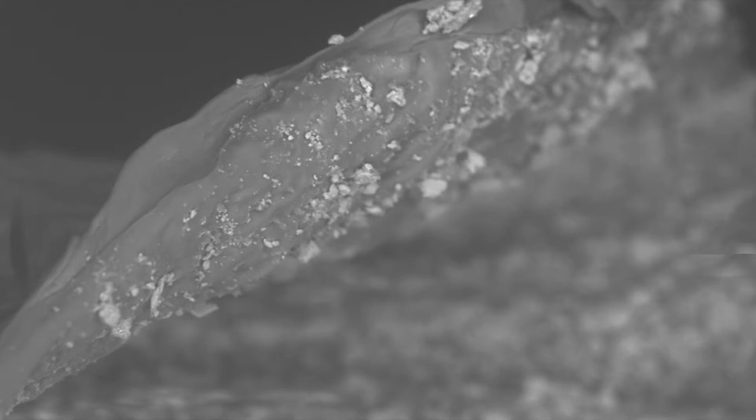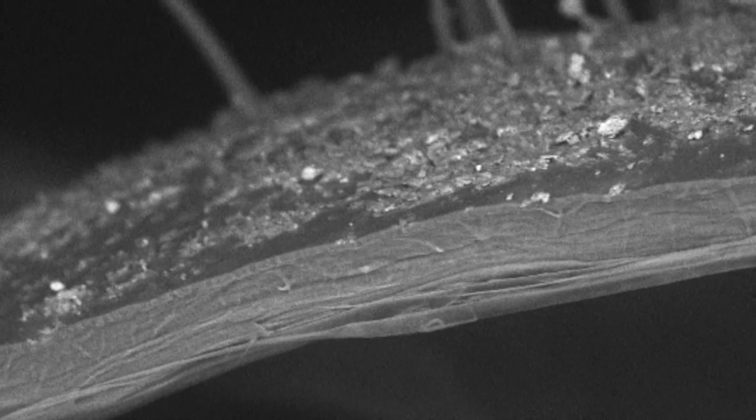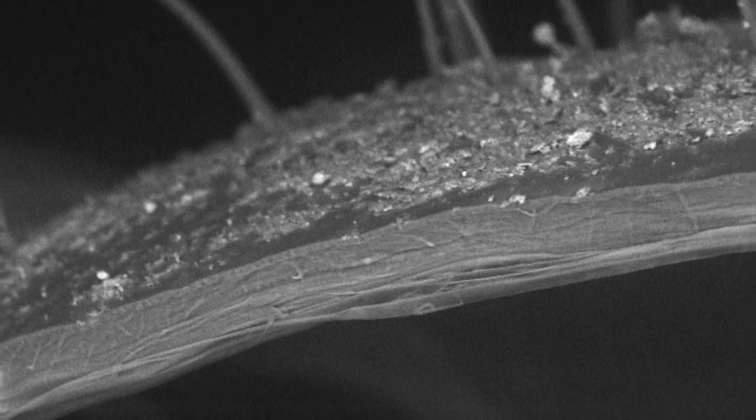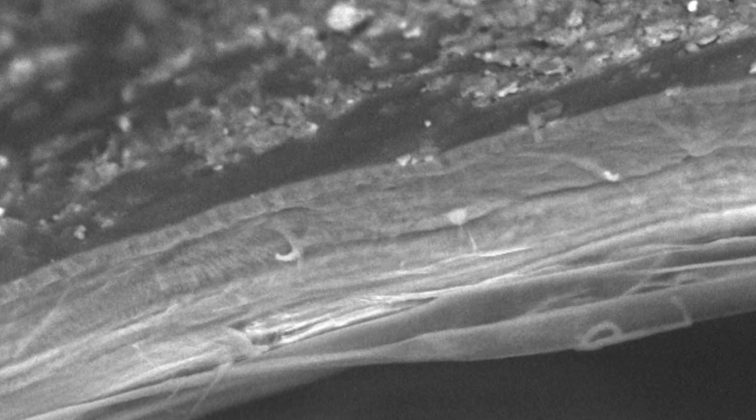But if you look at this fracture, I didn't really see dimpling, so I was wrong about that, but it is an irregular surface, which is why it's reflecting the light more. It seems to start cracking on that outside edge, and it has almost like a case before it comes into river lines pointing towards the interior part of the animal itself. This makes sense because when you're bending something, it tends to crack on the outside surface before it cracks on the inside surface. And so you've got river lines, which are flowing back towards the interior of the shell. So I thought it was very interesting.